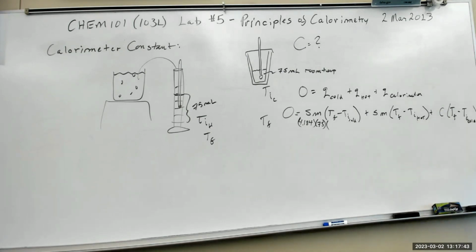It could be almost anything. In that previous problem, it was usually 10 joules per degree C. If you don't know what the value is, then you can use 10 joules, but it's probably not going to be that. It's probably going to be larger.